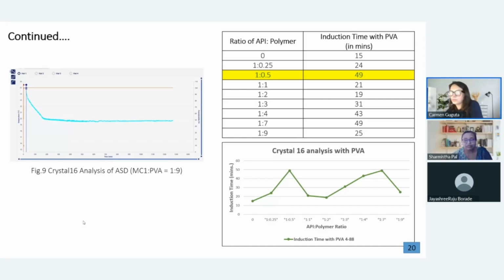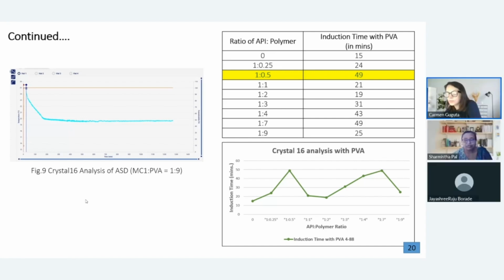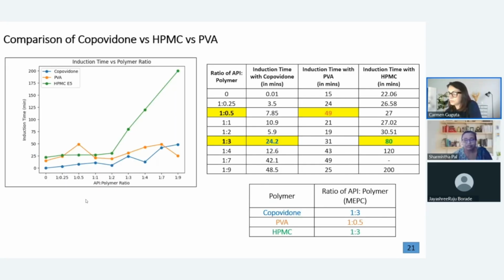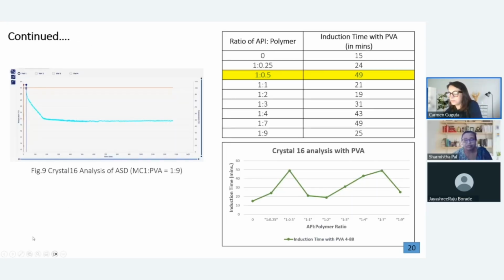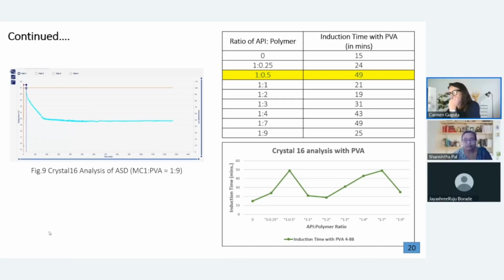This suggests that higher PVA concentration reduces effective supersaturation, likely due to a decrease in solubility, or unfavorable nonlinear drug-polymer interactions, or flipping from a nucleation inhibitor to a nucleation promoter at the threshold concentration. As a result, the system exits the supersaturated state faster, promoting earlier nucleation and then crystallization.